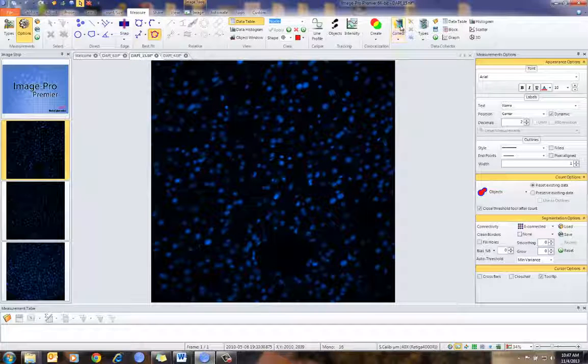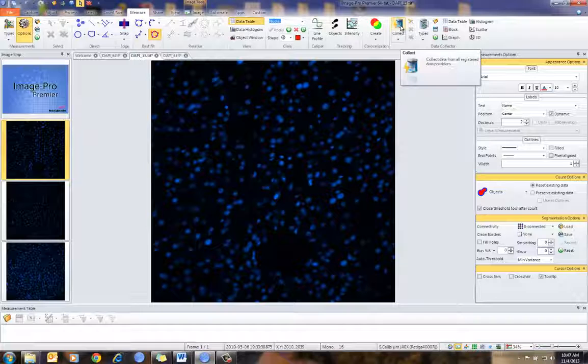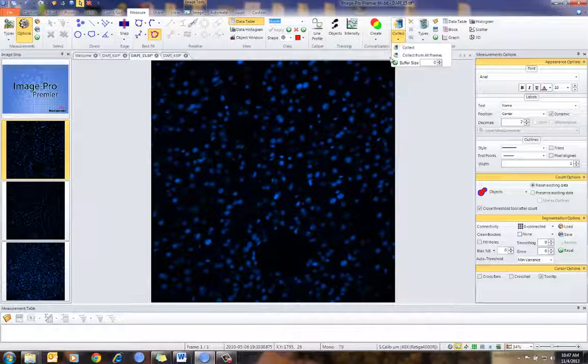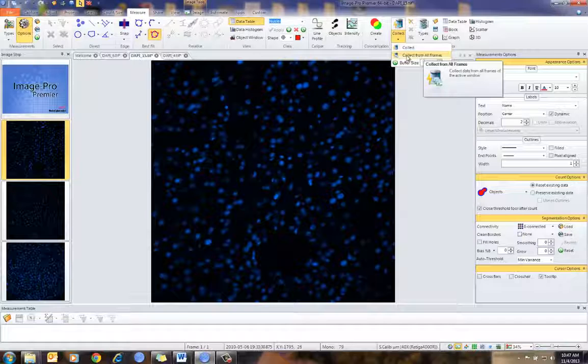One tool is I can collect the data from the counted image. There are also a few special features here to count from all frames.